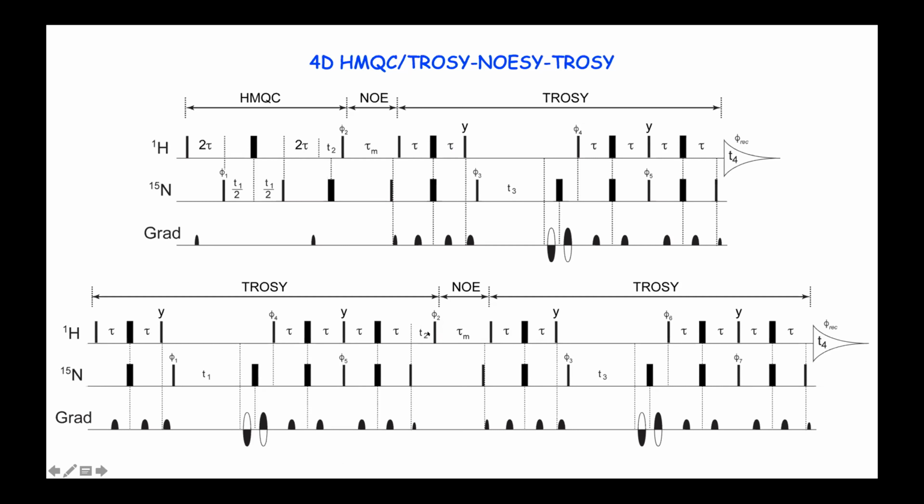So when I looked at the plane of T2, F2, and F4, or F1, I forgot, F2, F4, I believe, I could not get the data correctly within TopSpin. No matter what I did, it was not right. And the problem showed clearly that it's a quadrature problem.